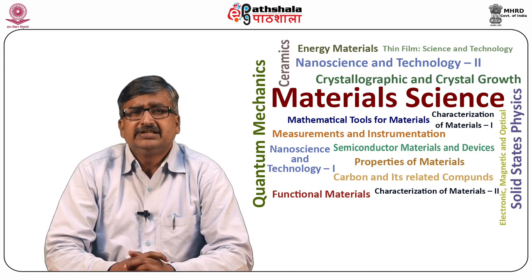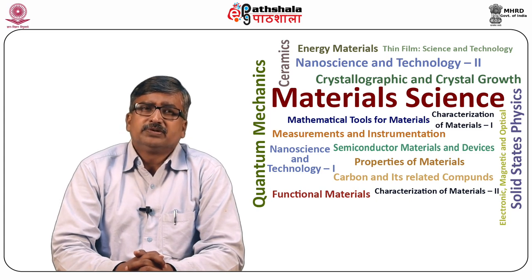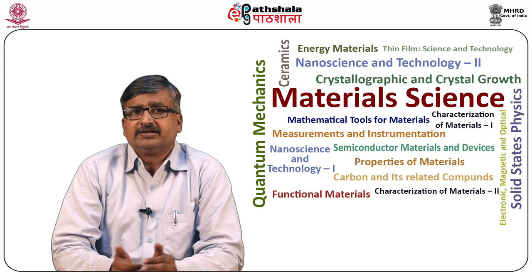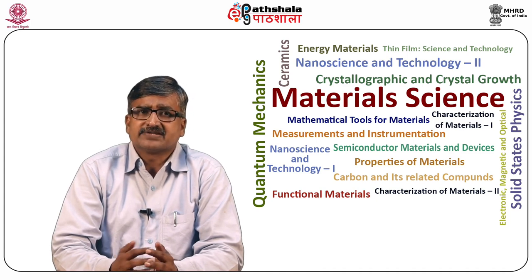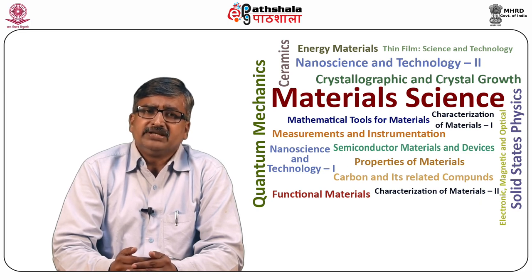So friends, let us summarize what we have learned in this module. This electron microscope: what the basic history behind it is, how it was developed, what the source is, for example, here we use electrons, and why we have chosen electrons, we have learned. How this electron works as a wave, and what its wavelength is, we have learned in detail. This electron microscope can be used for crystalline as well as amorphous samples. One can use it to identify phase, orientation, and crystal structure, and these data can be correlated to nanostructure features in the SEM images.